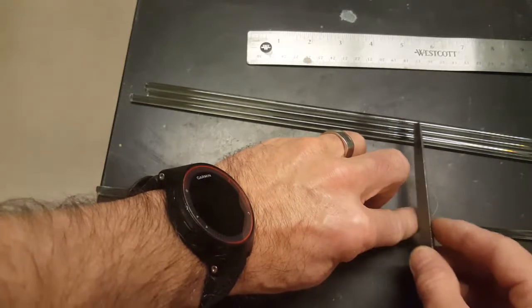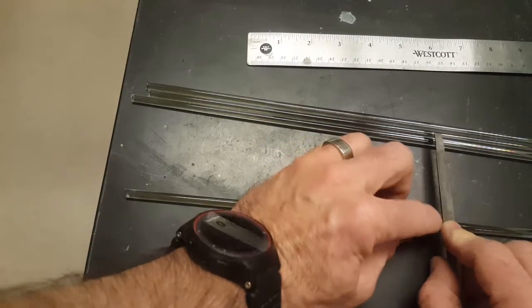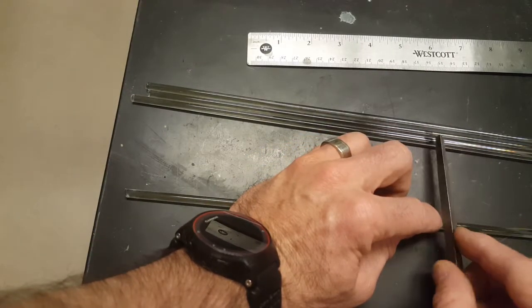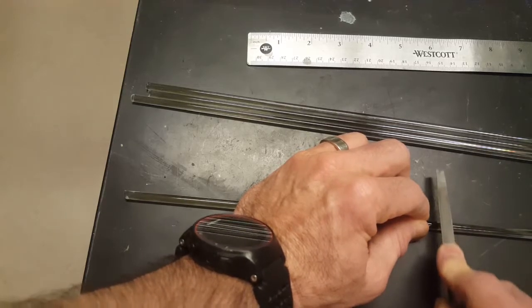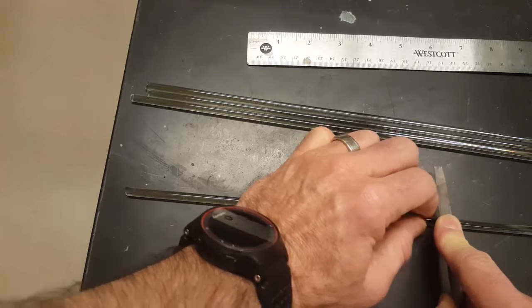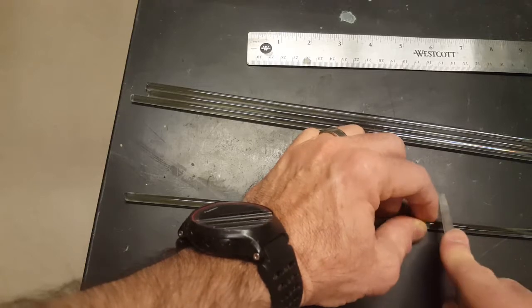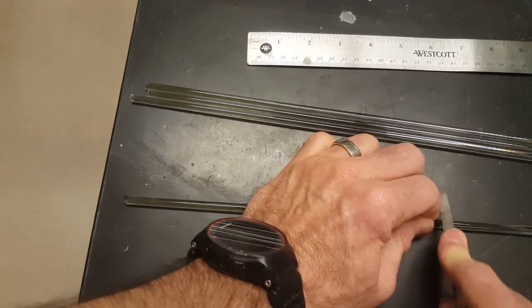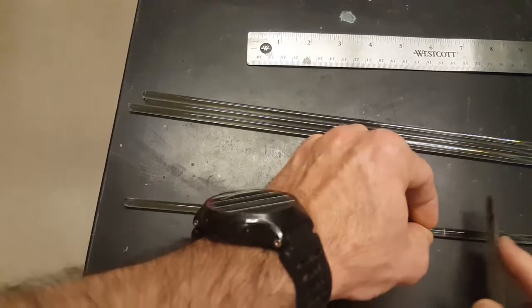Step two: take your file, place it on that nine-inch mark, and on the very pointy edge of the file, rub it back and forth until it makes a groove that the file stays in. You can see the mark that I made right there — keep making that groove around in a ring.